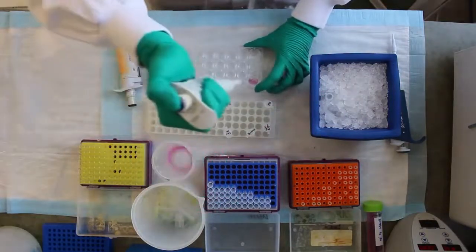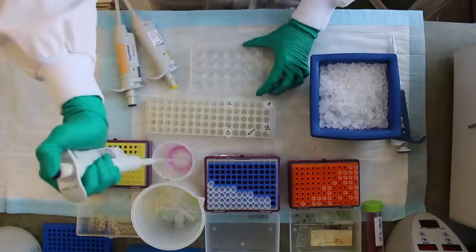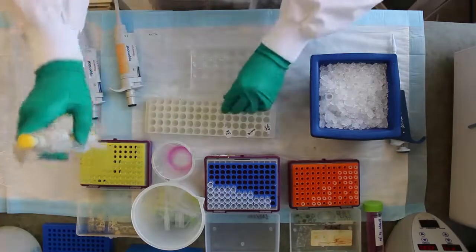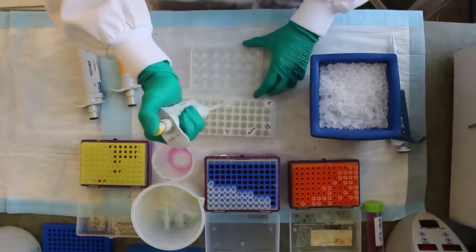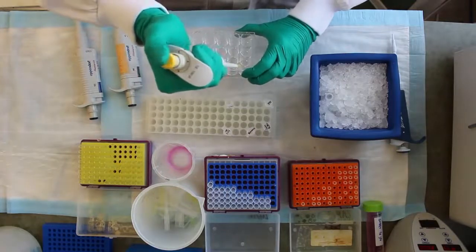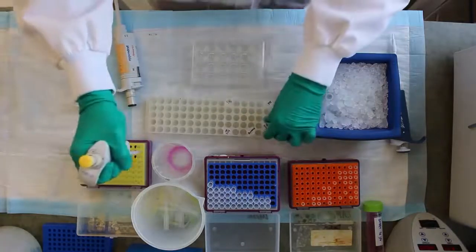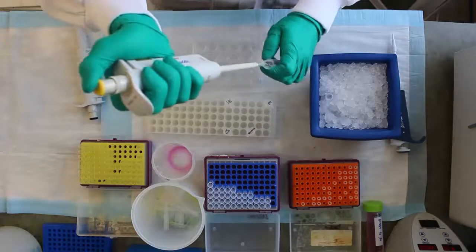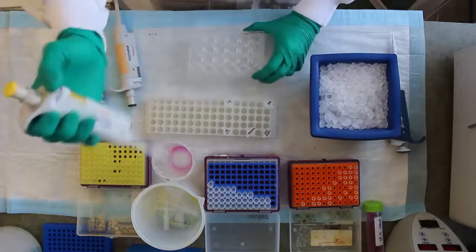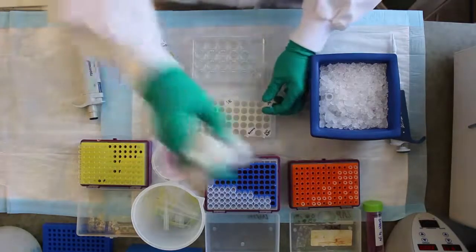Remove all media from the wells. Wash with 100 µL PBS, then add 60 µL of lysis buffer to the well. Incubate for 1 minute at room temperature, rocking the plate to distribute the lysis buffer evenly over the cells.